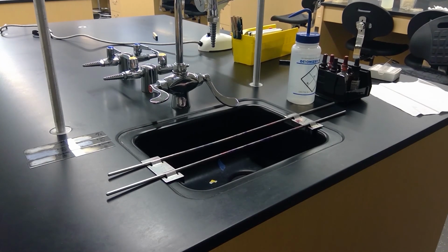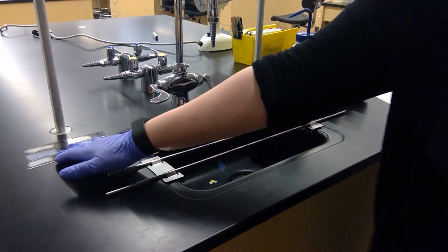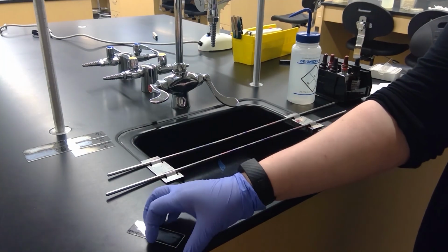Alright, so now we're ready to begin the gram stain procedure. You will use the gram stain to determine cell shape and whether your organism is gram positive or gram negative. To use time effectively, you should stain all 3 smears simultaneously. So I'll put all of my slides onto the slide rack.